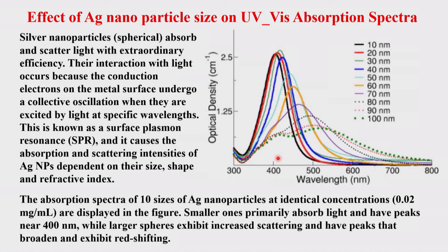One is giving the surface plasmon resonance absorption signal around 410 nanometer. The other is giving around 510, 520 nanometer. So you can very well identify the shape, size, and sometimes even some structural or symmetry features. It also depends on the refractive index, because you are looking at the plasmon resonance at the surface level.